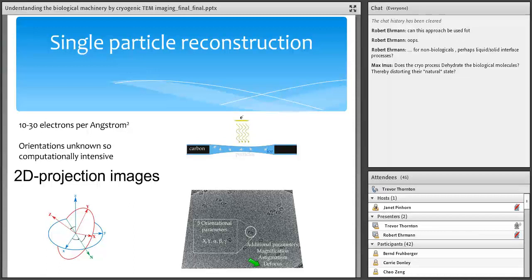That is so odd, isn't it? Because all the microscopes I've ever used, you want to have the best possible focus, and now here you're defocusing. So you want to work at what's called Scherzer focus, which will be where there's no Fourier inversion due to the contrast transfer function. And so that's basically inducing contrast by making your image bad.